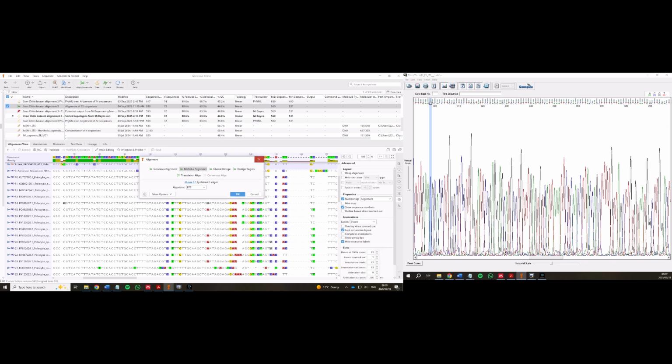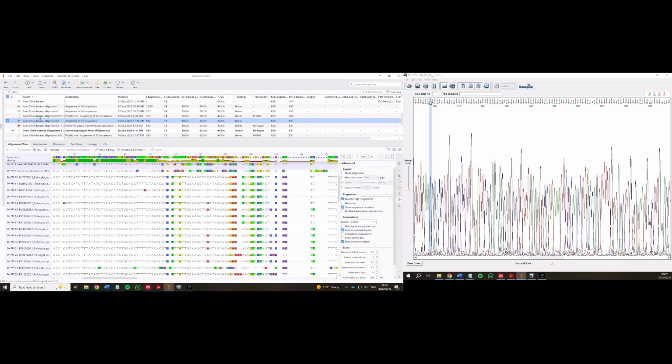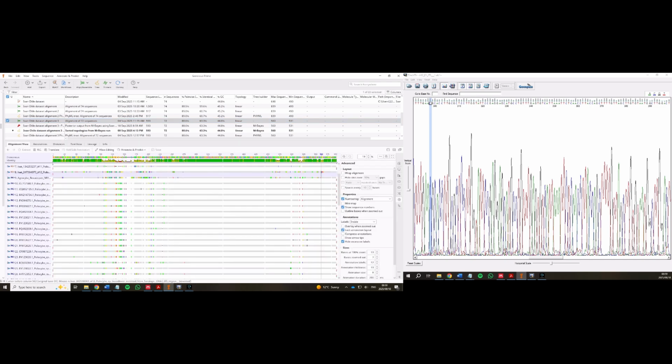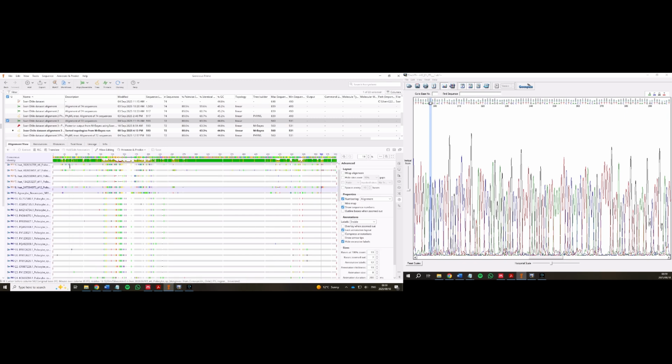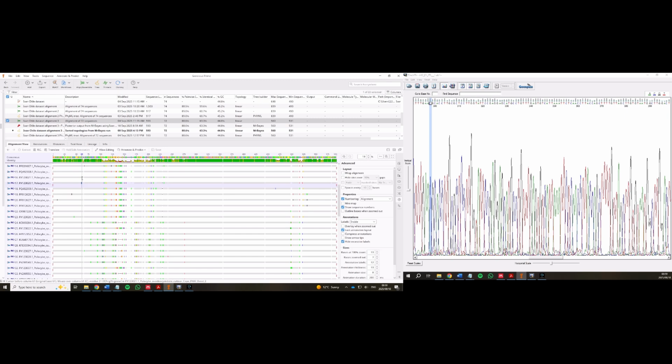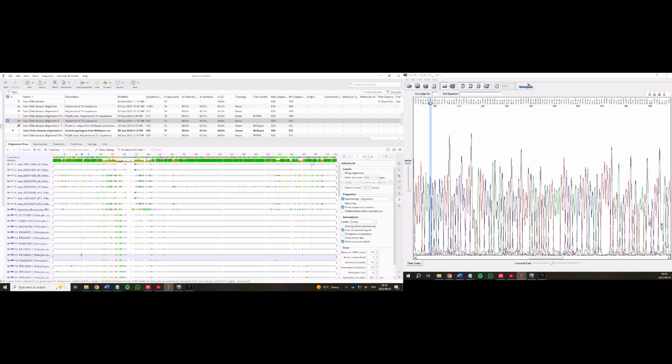Once the alignment has run, this is what it would look like. Again, here you have to trim off both ends of the alignment. You want a nice clean block. So if you have overlapping ends, you just trim them off so it makes a nice clean block of sequences on either side. If you have some sequences that are really short, you can just delete them. Just make sure you have other reference sequences for that same species. Alright, once your alignment is a nice clean block, you can build your tree.